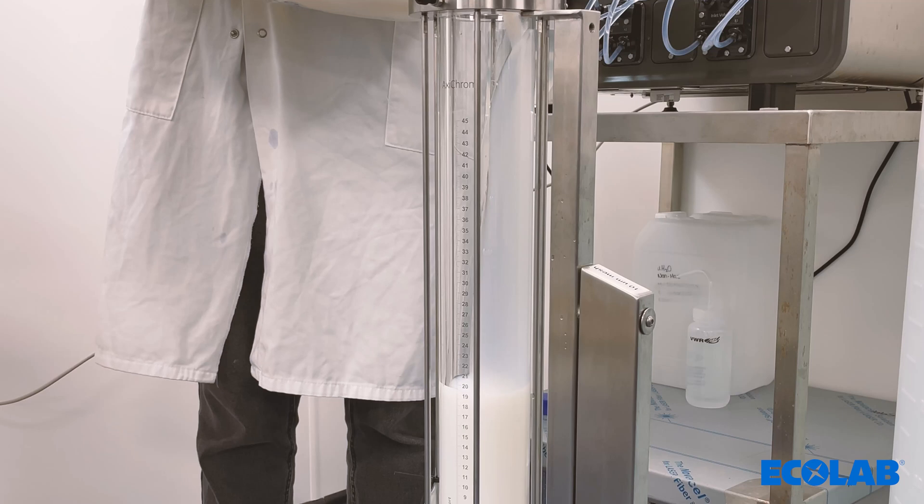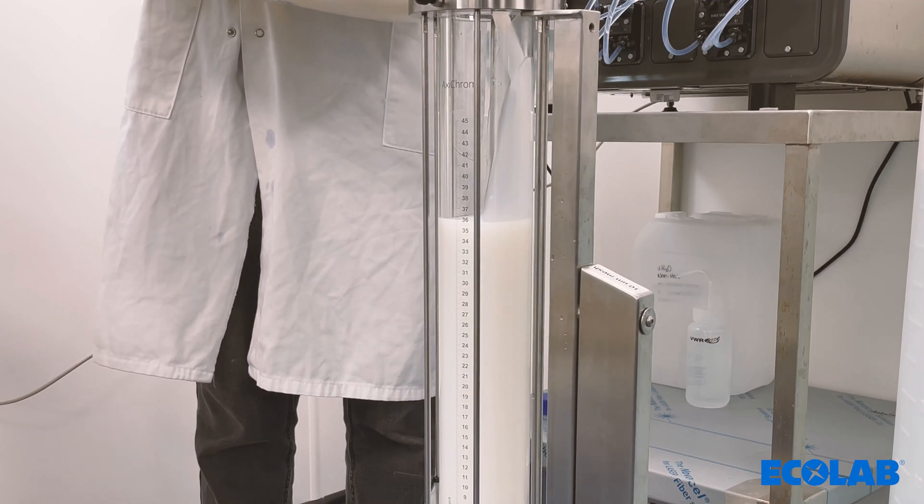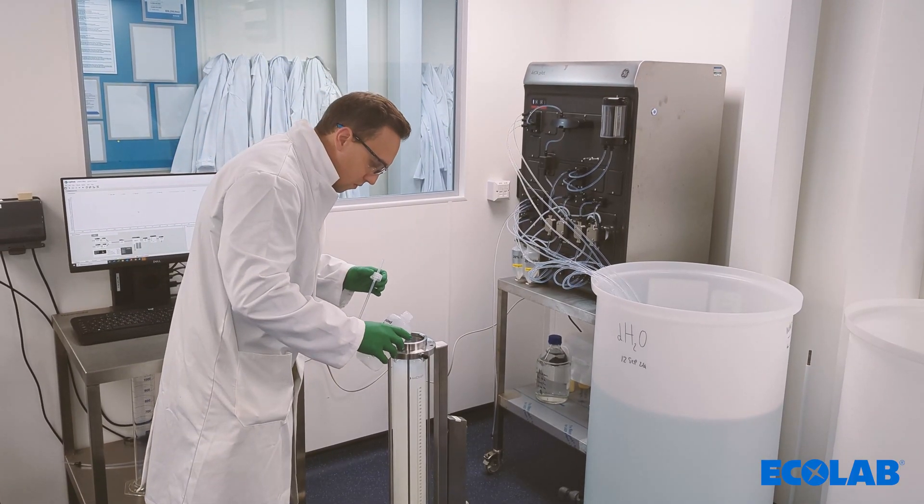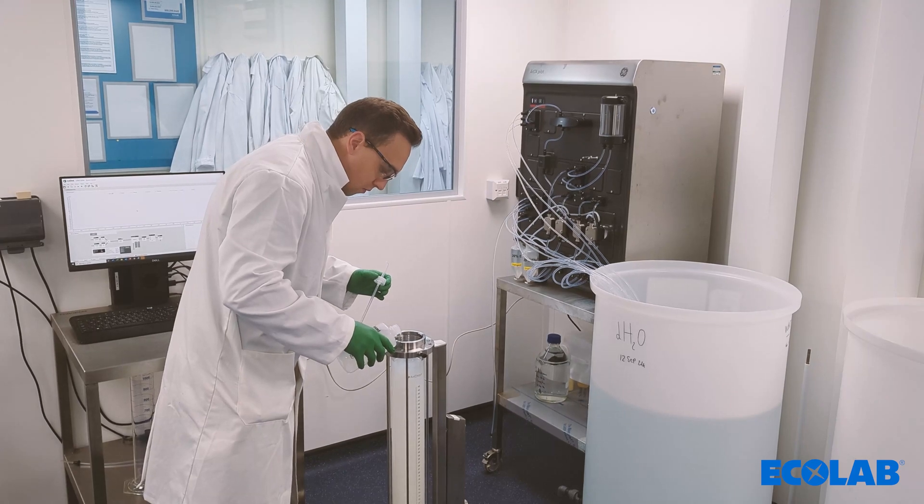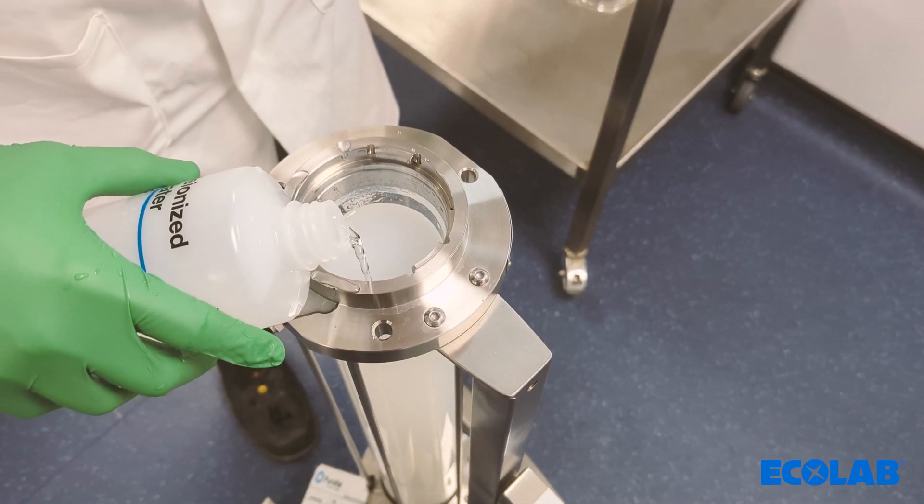The calculated volume of resin can now be added to the column and if needed, top up the liquid level to the top of the column using the packing buffer. Perform a buffer exchange from the storage solution into the packing buffer by either washing the column with a low flow or decanting the liquid level after settling the resin.